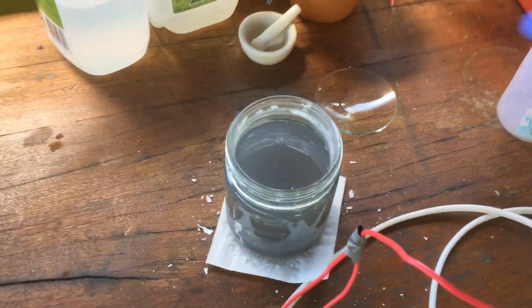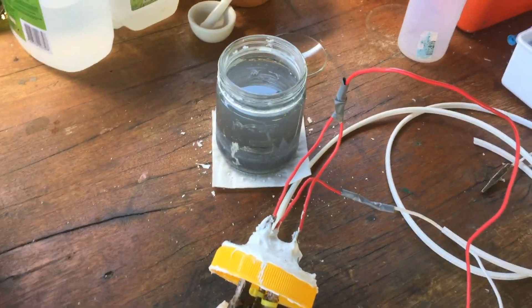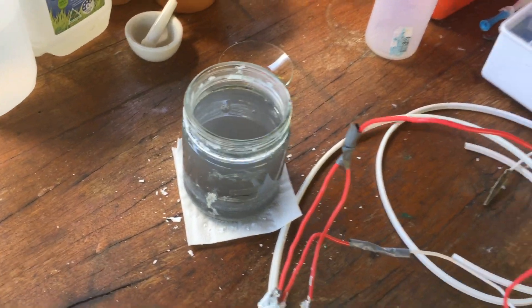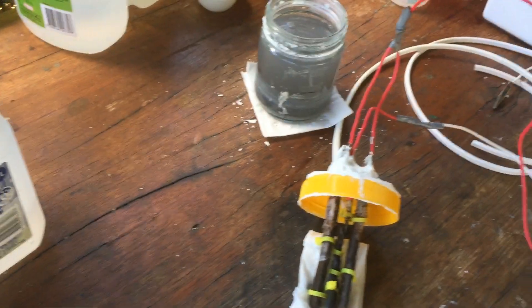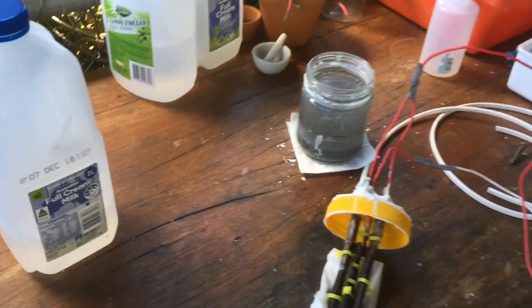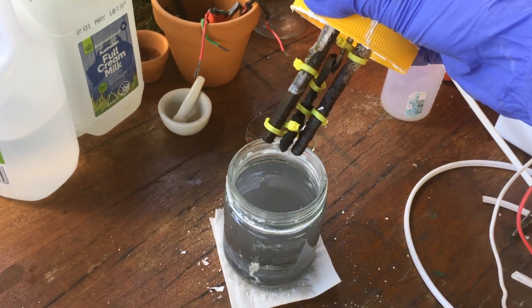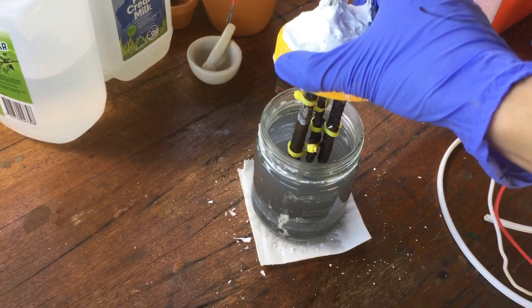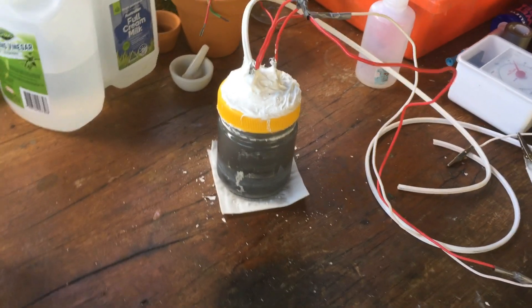I've decided we won't be filtering any of the solids coming off the electrodes, because they don't really hurt the reaction. Every time we filter this stuff we just end up losing a little bit of water, and we're at the stage now where we really don't want to be losing any water where we don't have to. So I'll just stick the electrode assembly straight back in, and that should be good to go.